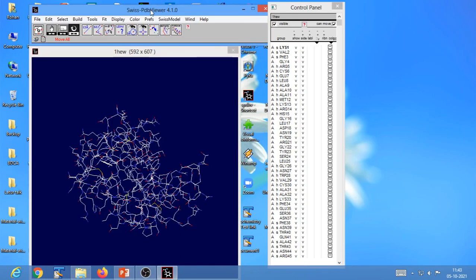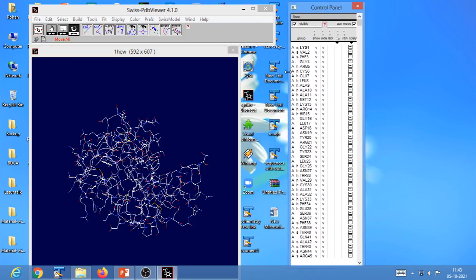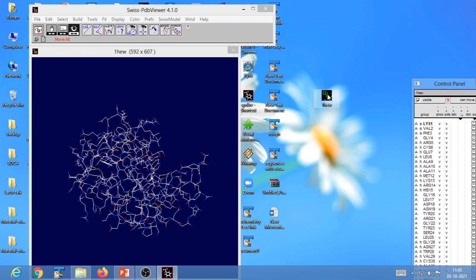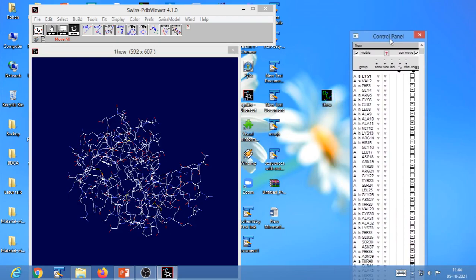We would start out by looking at the enzyme lysozyme in complex with a trisaccharide inhibitor. We would further refer to this inhibitor as trineg. The atomic coordinates of this model are contained in the Protein Data Bank file with code 1HEW. I also demonstrated in our previous lecture how to download this protein molecule from the PDB website.